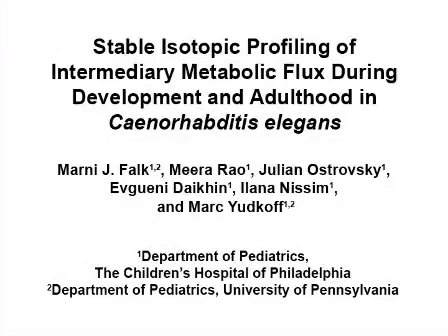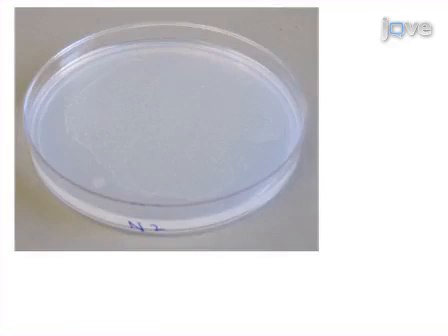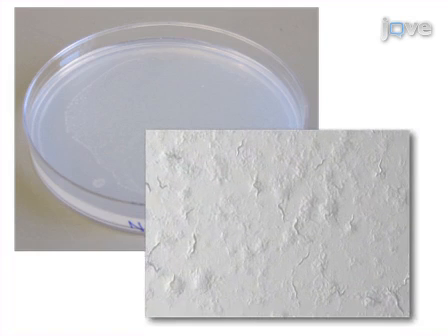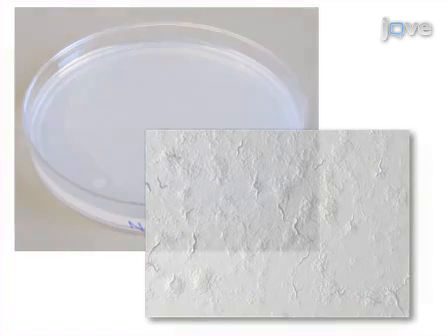The overall goal of the following experiment is to non-invasively monitor real-time metabolic alterations at the whole animal level within glycolysis, pyruvate metabolism, and the tricarboxylic acid cycle that are caused by individual metabolic pathway genetic alterations and/or pharmacologic treatments. This is achieved by feeding stable isotopes to living nematodes to provide sufficient isotopic enrichment in worm metabolites to permit quantitation of genetic and/or pharmacologic alterations in intermediary metabolic pathways.